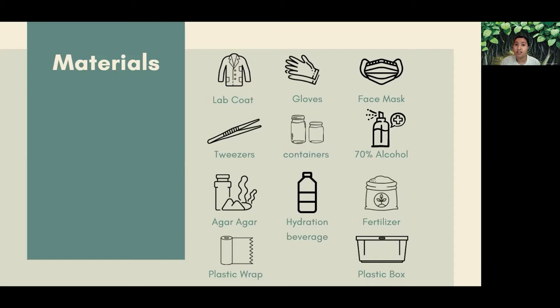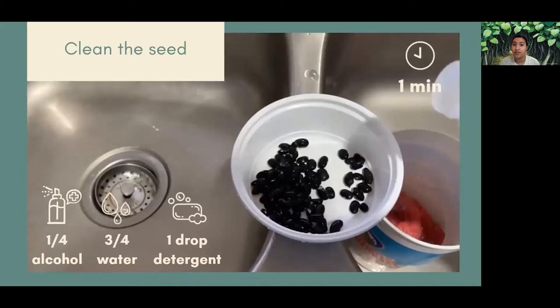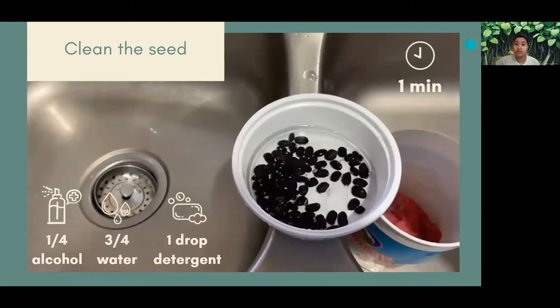So first, you're gonna sterilize your containers for 30 minutes in boiling water. Then you're gonna proceed to clean the seeds. I use a mix of alcohol, water, and a drop of detergent. This was for only 1 minute.